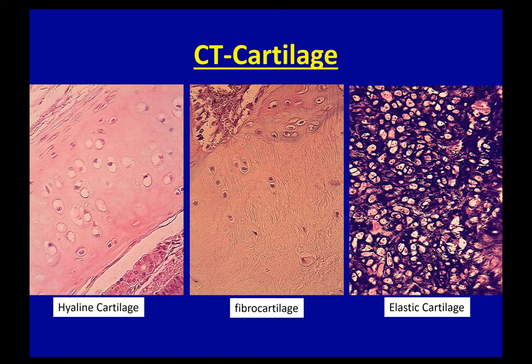All right, so let's talk cartilage. Whenever I look at cartilage on a slide, I always think of deviled eggs sitting in red jello, whether it's strawberry jello, cherry jello, whatever, but that's what I think of. And kind of like with muscle, you have two that look really, really similar, these two right here, versus one that looks like the redheaded stepchild that doesn't match in the family at all.